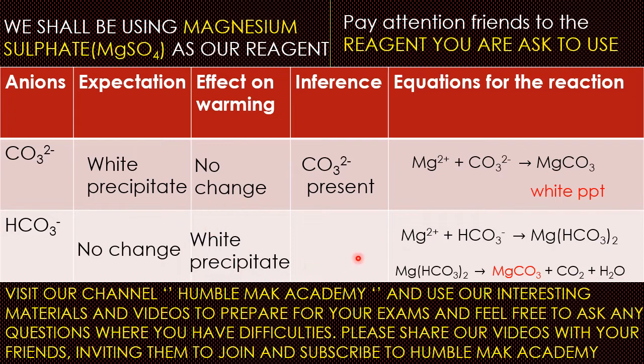Good. Then now guys, our inference, what are we going to say? Good. That the hydrogen carbonate ions are present. So guys, as easy as this, you could still go further if you really want to know, or you might want to tell them so well that it is this ion that is present. You might want to go with a litmus paper, a blue and a red litmus paper.